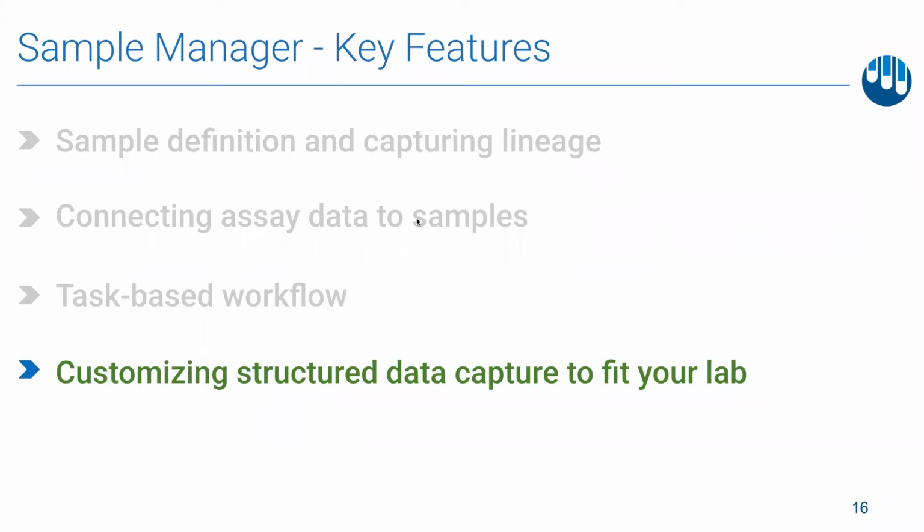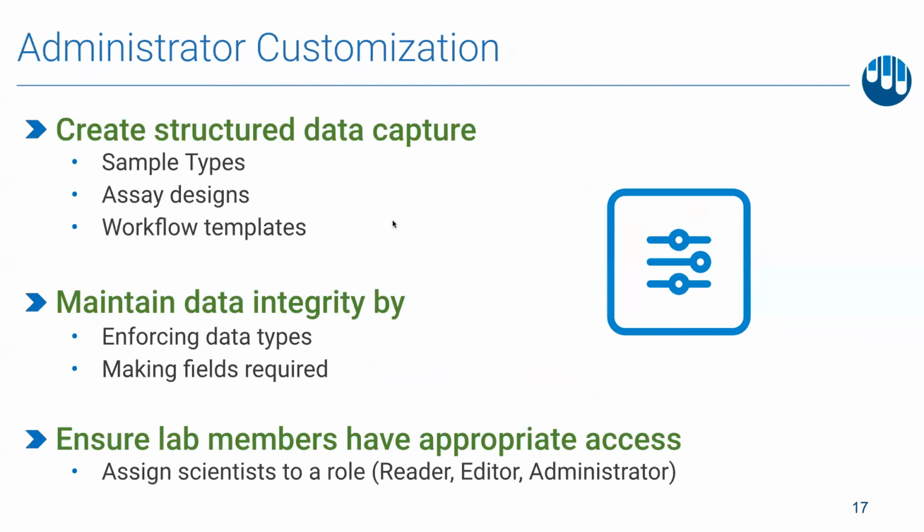Although we haven't yet called it out as a feature for Sample Manager, customizing the samples, assays, and workflow templates for your lab is important to making the application relevant for you and your team. Lab managers or other administrators can set up Sample Manager to capture the data that is most relevant for their labs.